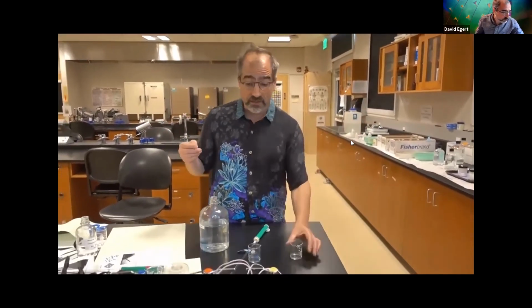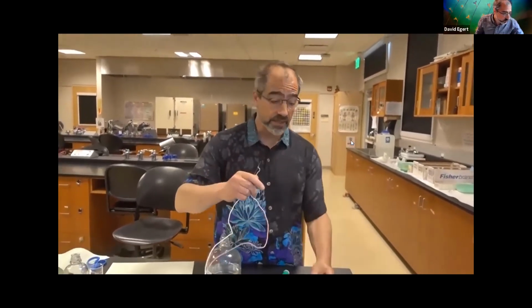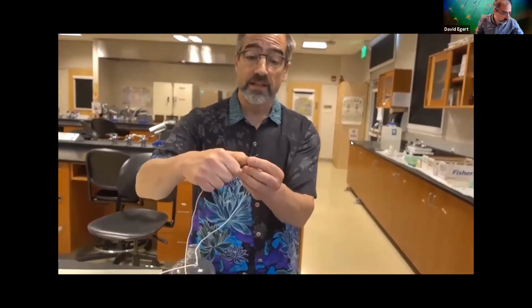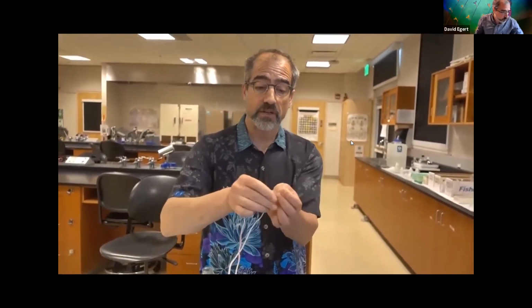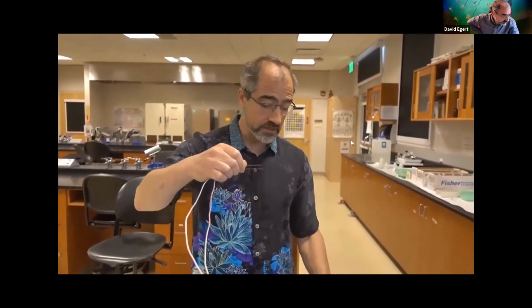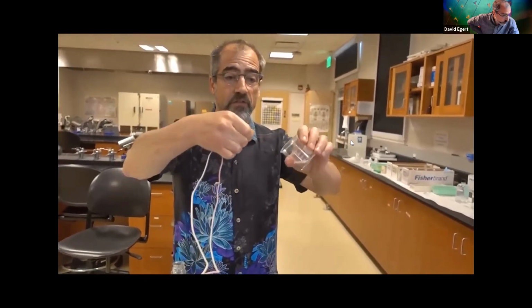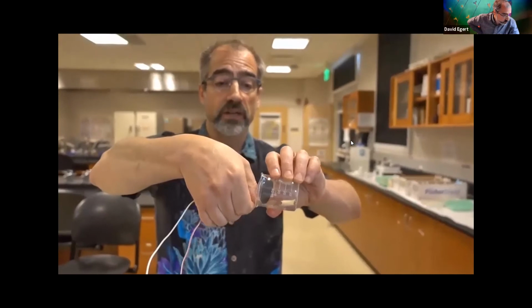But then we're going to look at another thing. So here we looked at, does it dissolve or not, which we did with the electrolytes. We can now look at the electrical continuity. Again, double checking. Okay. System is online. I'm going to hold my little wires parallel so they're not touching. And now I'm going to fully submerge them under this sugar water.